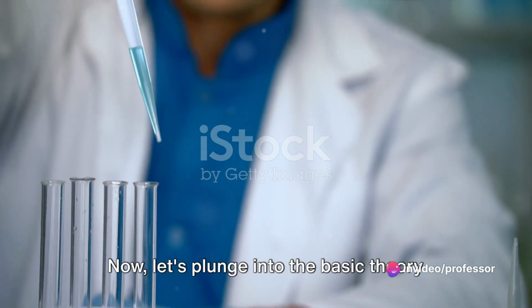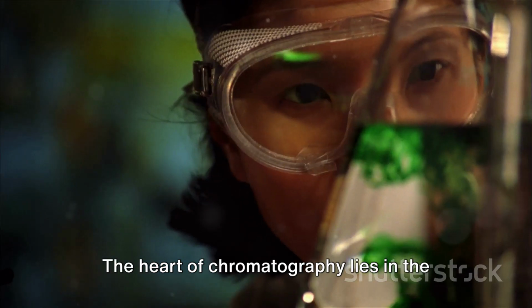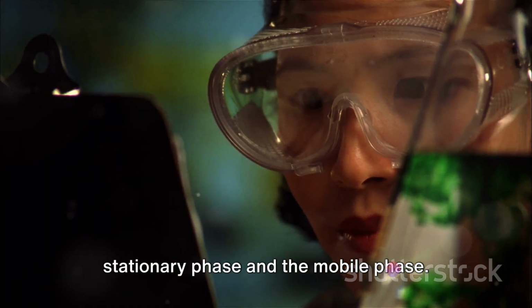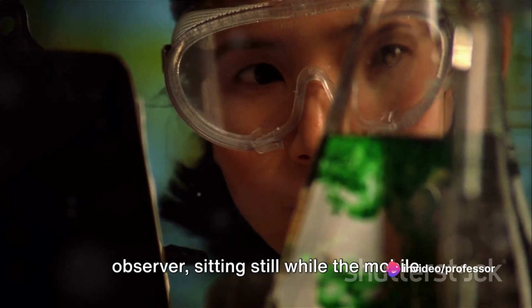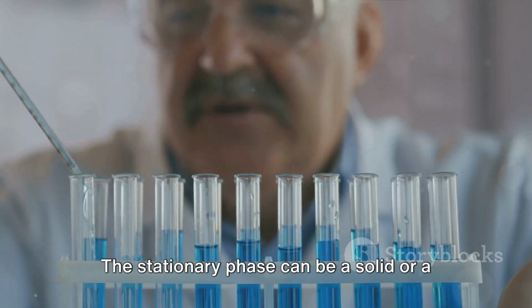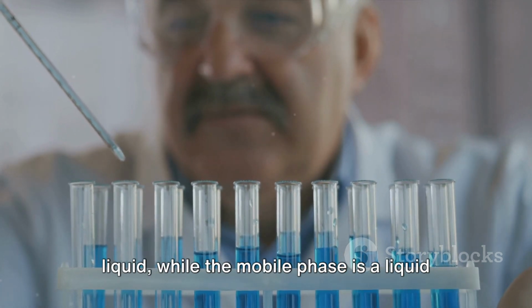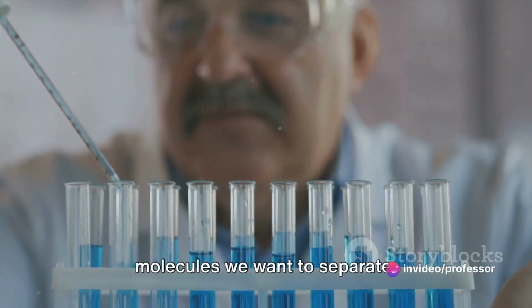Now let's plunge into the basic theory behind chromatography. The heart of chromatography lies in the interaction between two phases: the stationary phase and the mobile phase. Imagine the stationary phase as a silent observer, sitting still while the mobile phase moves right through it. The stationary phase can be a solid or a liquid, while the mobile phase is a liquid or gas that carries the mixture of molecules we want to separate.